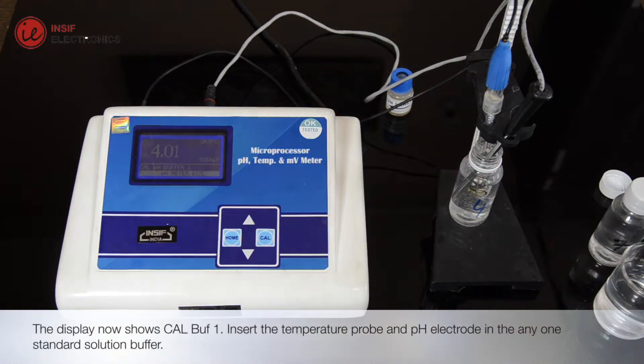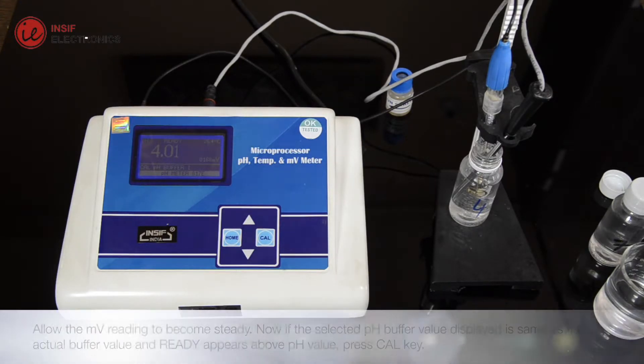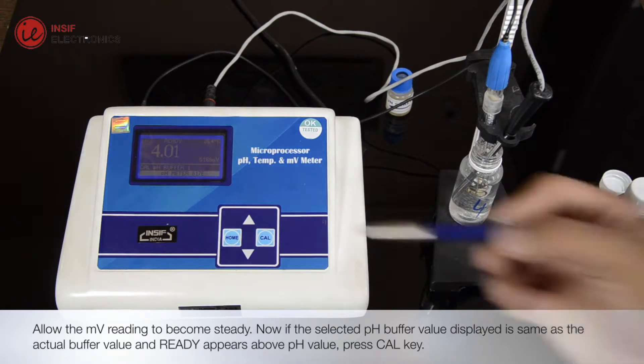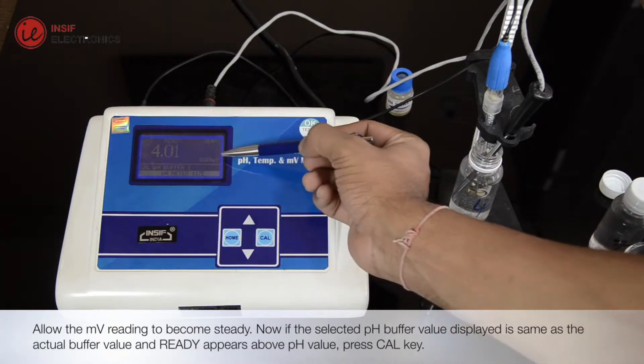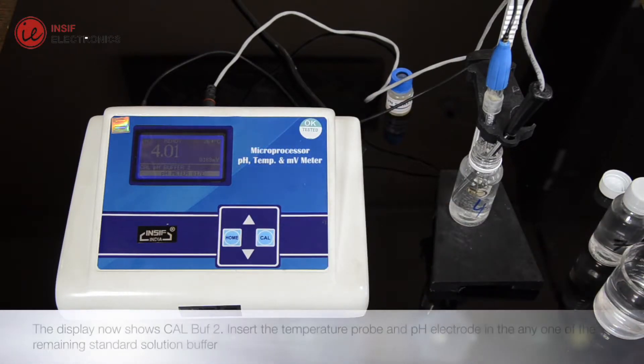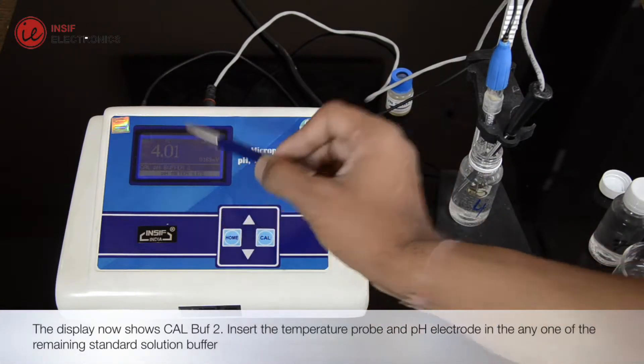Insert the temperature probe and pH electrode in the NE1 standard solution buffer. Allow the MV reading to become steady. If the selected pH buffer value displayed is same as the actual buffer value, and ready appears above pH value, press Cal key. The display now shows CalBuff2.